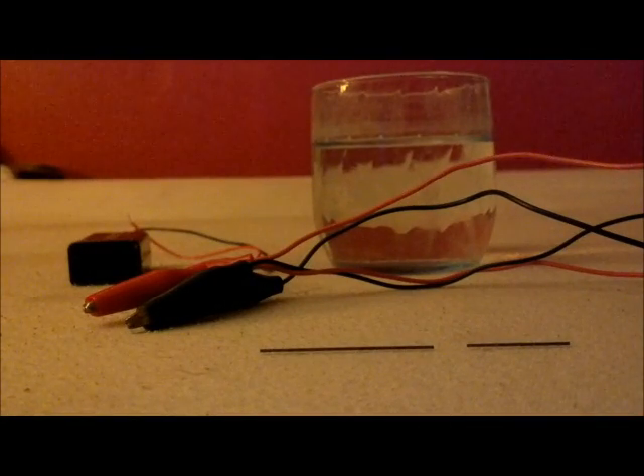Alright, hey there everybody, I'm back and I'm going to teach you something real cool today. This is called electrolysis and we'll be electrolyzing water. What we're going to be doing is we're going to be separating H2O into its two ordinary elements, also known as hydrogen gas and oxygen gas. We're going to be doing this through electricity running through the water, separating the bonds.